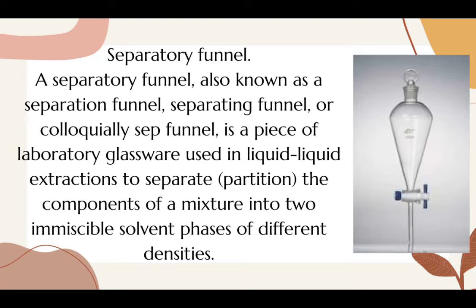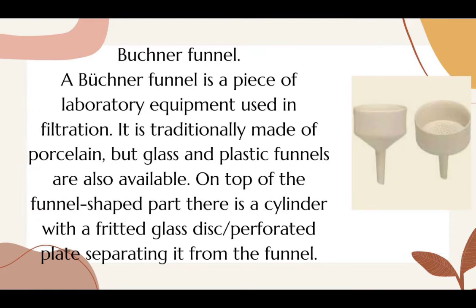Separatory funnel. A separatory funnel, also known as a separation funnel, separating funnel, or colloquially sep funnel, is a piece of laboratory glassware used in liquid-liquid extraction to separate, partition the components of a mixture into two immiscible solvent phases of different densities. Buchner funnel.